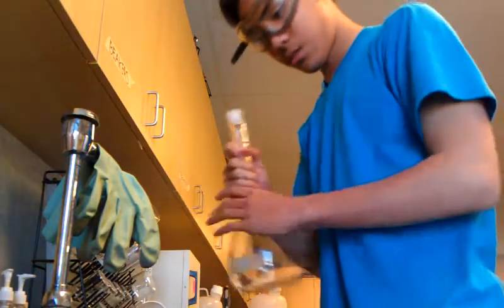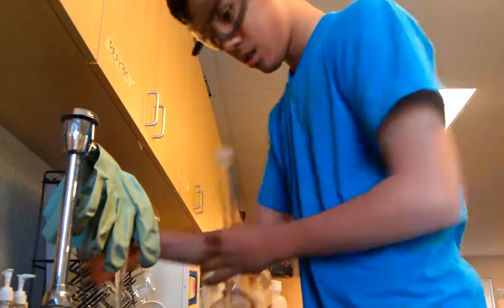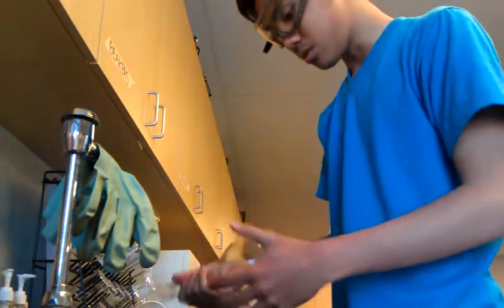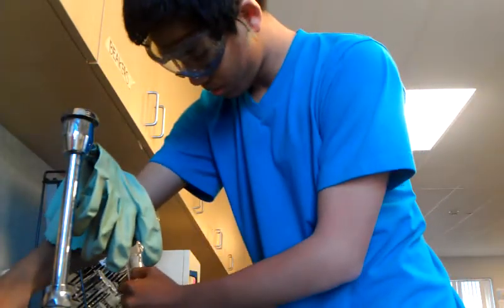Hey guys, I'm going to show you how to clean a volumetric flask. First, you want to add tap water in small quantities in order to remove whatever base or acid water solution was in here previously. You want to do this three times with tap water in small quantities.